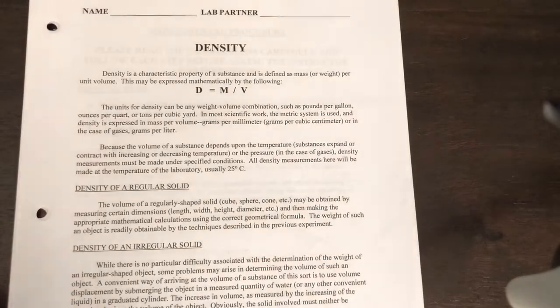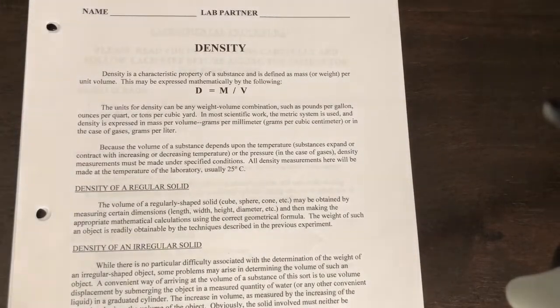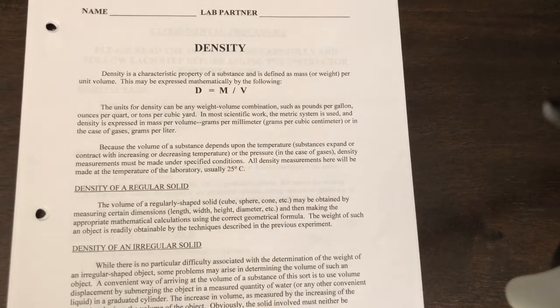Okay guys, so in this lab we're going to be discussing density. Density is the ratio of mass to volume. Our mass is usually found by going to a scale, a triple beam balance or electronic scale, and it's always in grams. Our volume is usually in centimeters cubed or milliliters.